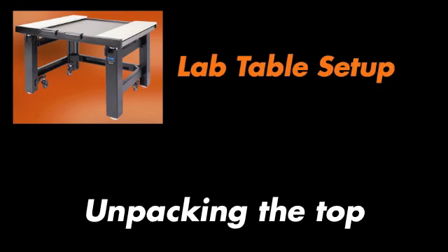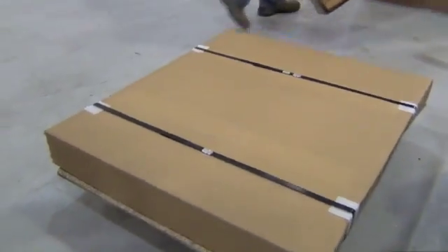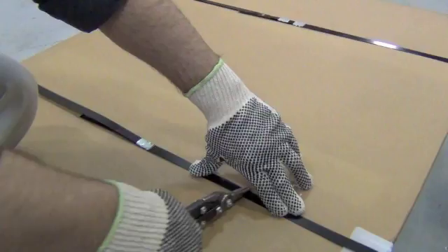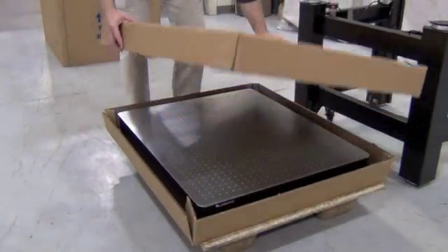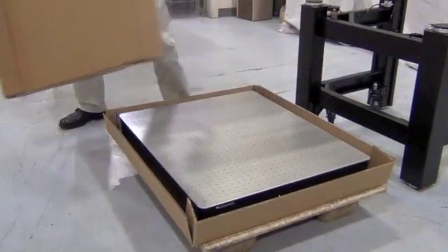For this table, the top is packaged separately. If you are opening a lab table with a 2 inch thick top, the top would be located inside the same box as the legs, not in a separate box as shown here.